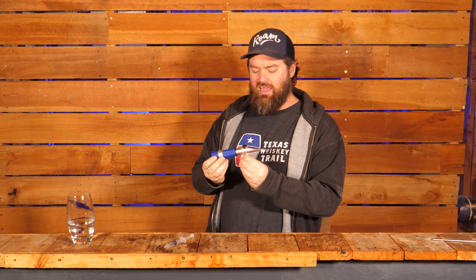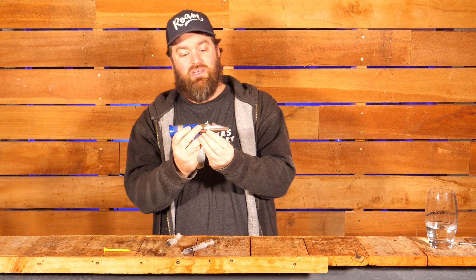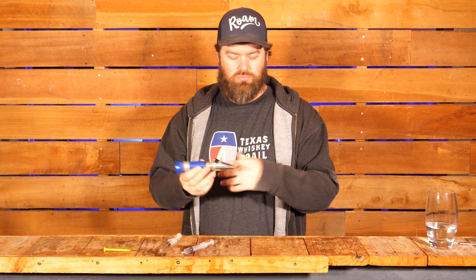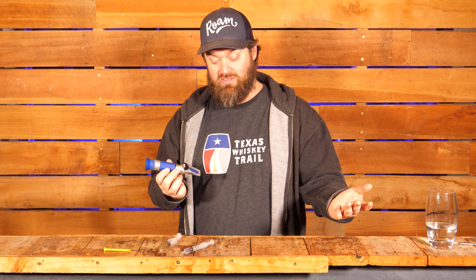Refractometers — these things are a bit of an enigma. There's a right way to use them and there's definitely a wrong way to use them. What this thing does is it tells you how much sugar is in solution. As brewers and distillers, that's important — either how much physical sugar we've added in a sugar wash, or how much sugar we're extracting from grains during a mash, or from fruits. We want to know how much sugar is in the liquid so we can gauge how much food we're giving the yeast.